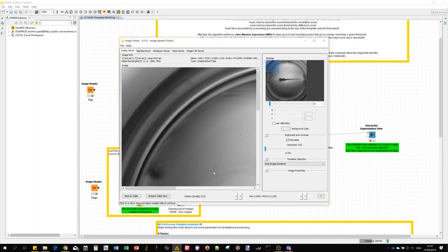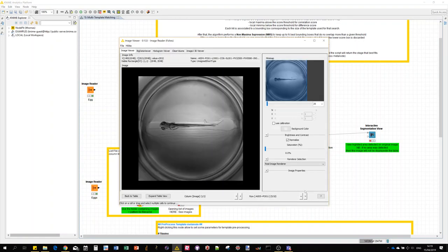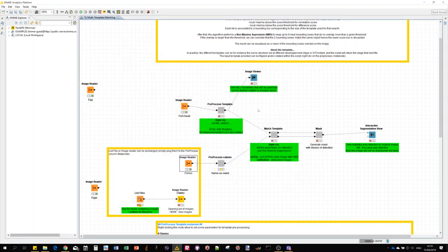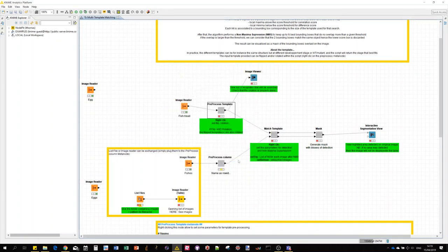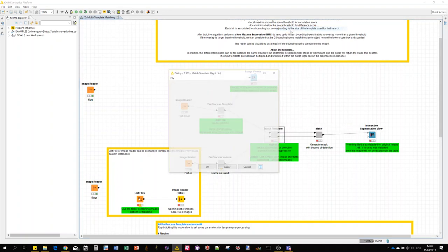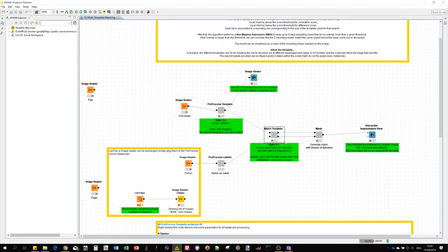This is my template and the corresponding images are here. This time I'm providing a list of images and they're all grayscale image, single channel images. I don't do any pre-processing again, no flipping or rotation, because the larvae are already aligned, so with a single template I should be able to locate them. Let me update the parameters for detection. We just expect one object in each image because we have one fish larva, and then those parameters are not even necessary to tweak for a single object detection actually.